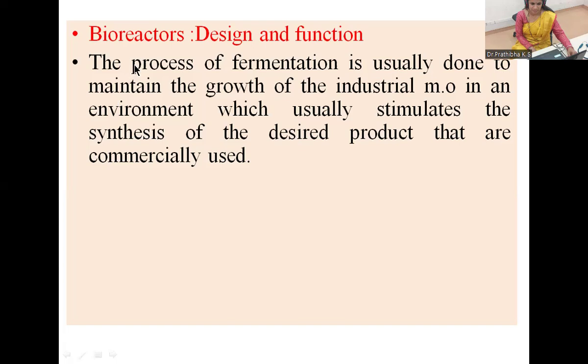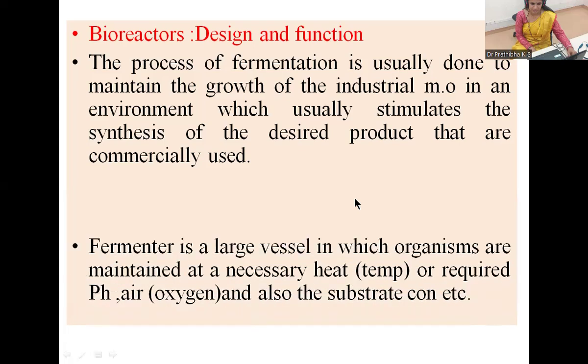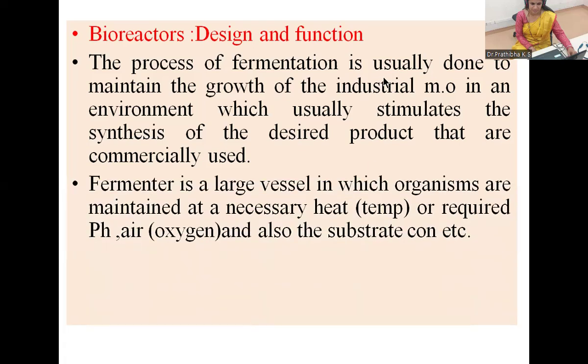The process of fermentation is usually done to maintain the growth of industrial microorganisms in an environment which stimulates the synthesis of the desired product that is commercially used. So in this particular fermentation process, or in the bioreactor, we are focusing more on industrially important microorganisms which could give a good yield of a novel product. Those organisms we are going to culture as the subject in the fermenter vessel.